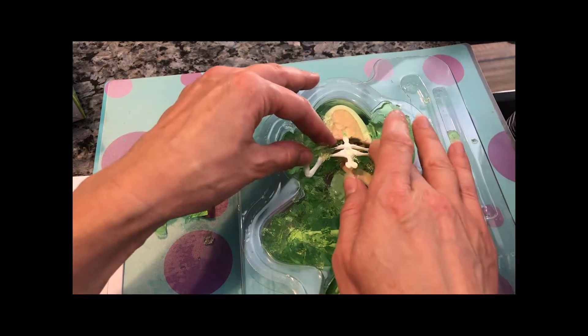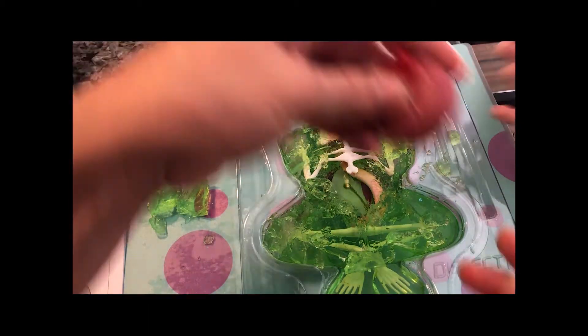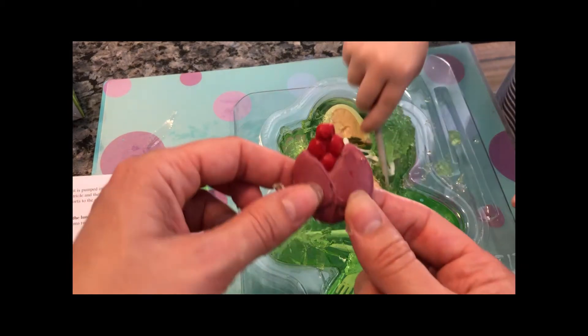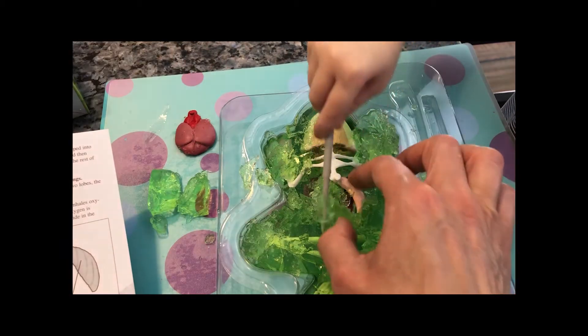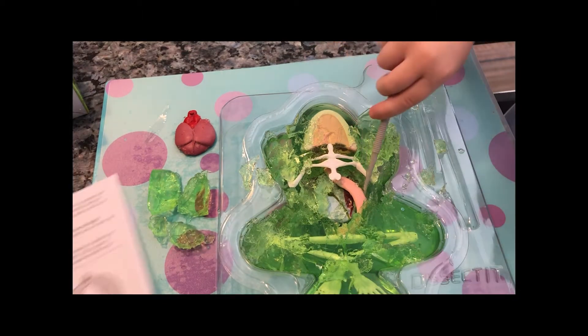You gotta move these ribs around. Are those the ribs? Yeah, I think it is. Alright, let me show this heart under here. Look at that — we got the heart out. I think we're supposed to find something else. That one. I found it.